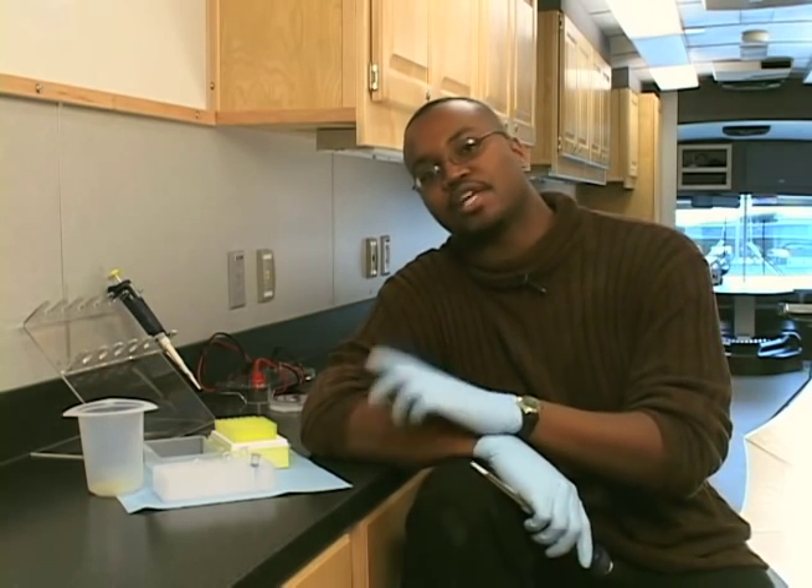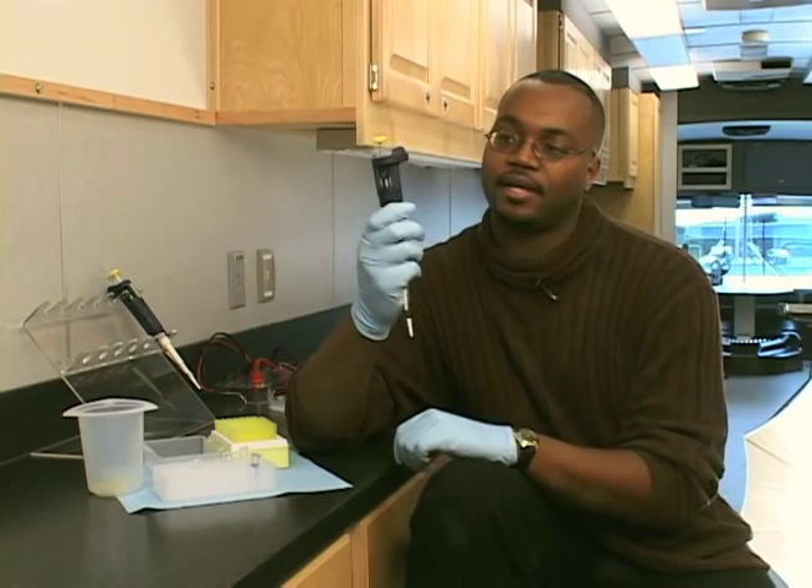Hello. My name is Dr. Antonio Baines. I'm a PhD scientist at the University of North Carolina at Chapel Hill. I specifically do cancer research, and one of the tools I use every day in the laboratory is the pipette.